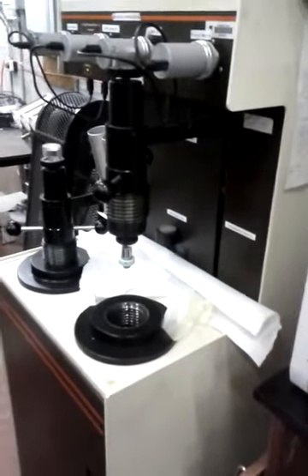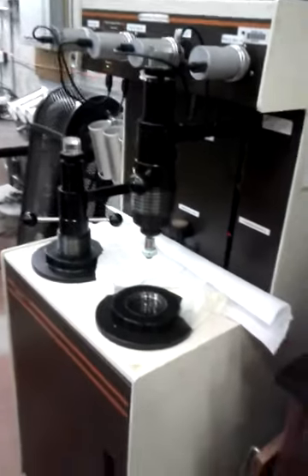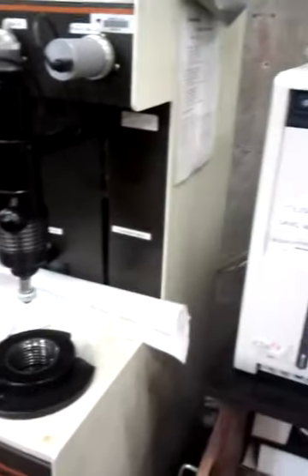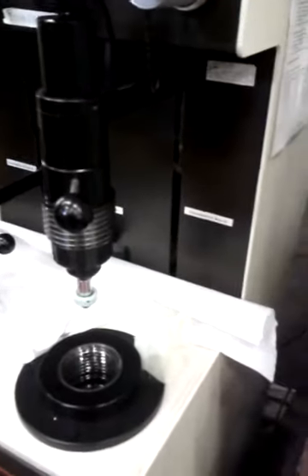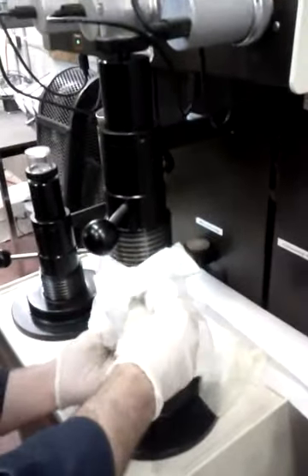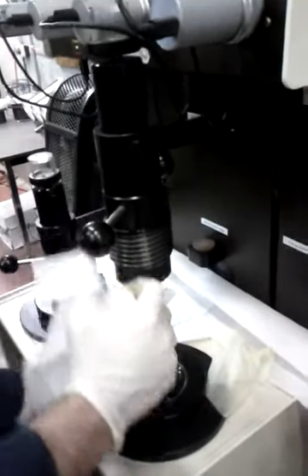Because there is a lot of oil in this part, we have to take some clean wipes and put it on.